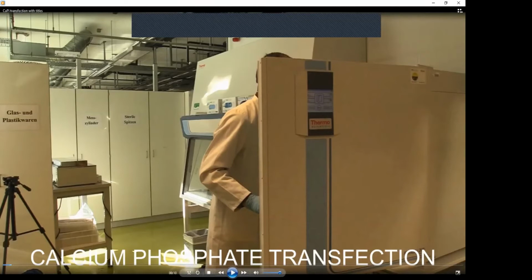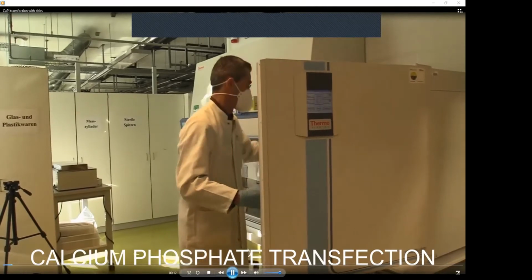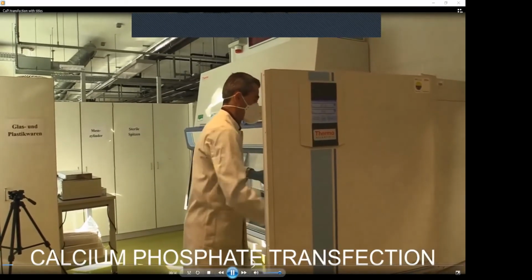The next day, the first step which you have to do for this transfection is that you remove cells from the incubator and you check whether everything is all right with them.